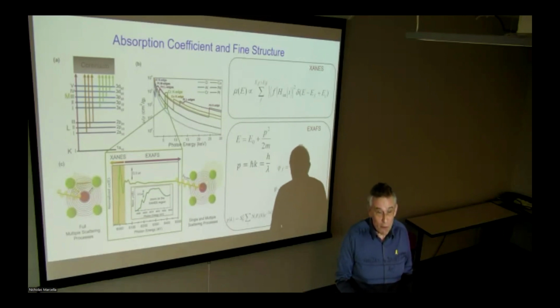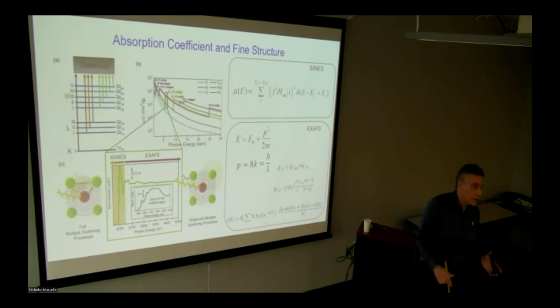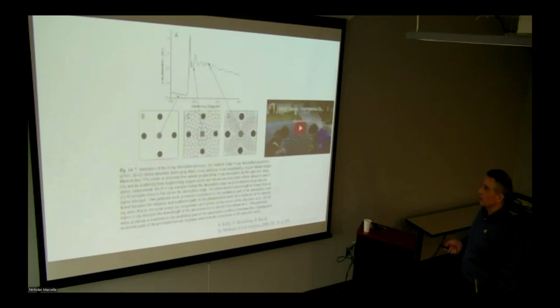Fourier transform. If you take Fourier transform of a sine wave, you will get a single peak, if it's an infinite sine wave, right? And that peak will be the frequency. And we are looking for frequency. For us, frequency is the interatomic distance here. So Fourier transform is the workhorse method of XAFS analysis. You take the data, you Fourier transform it, you already can run along. You can see if the peaks shift to the right, they shift to the left. That's like measuring the interatomic distance. You can use a ruler to measure how much the peaks shift, and that can give you a relative change pretty accurately. Nobody does it with a ruler, just saying. It's not that far removed from just looking at the data and telling what's happening. Although advanced analysis is very important for better understanding.